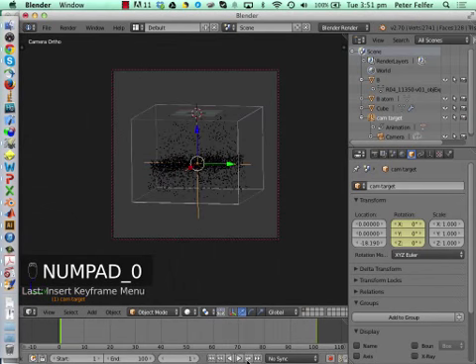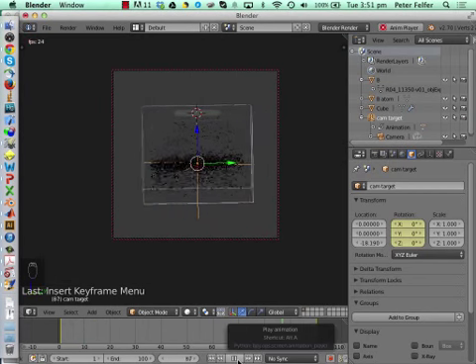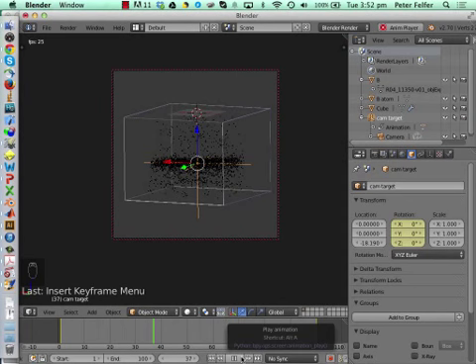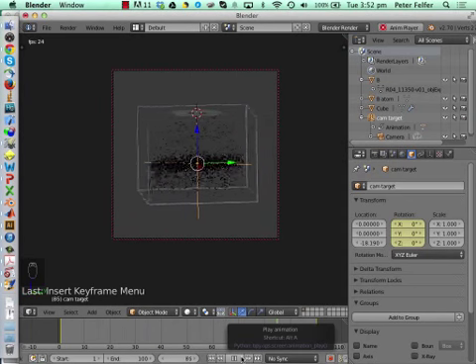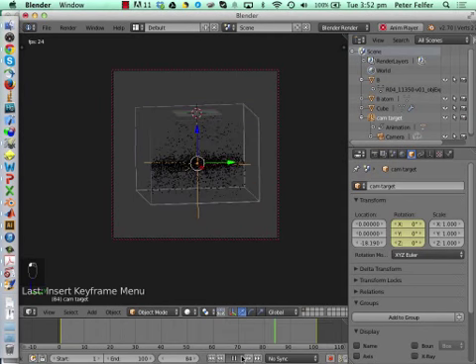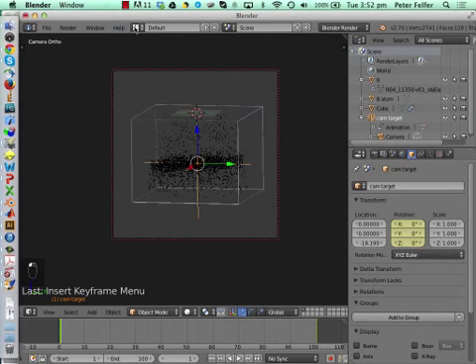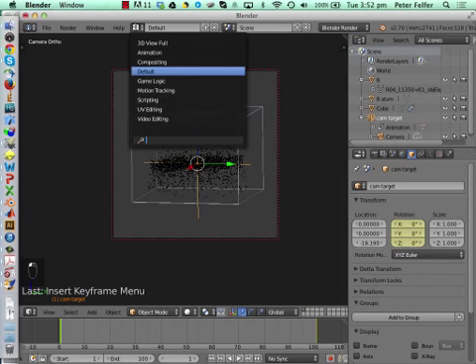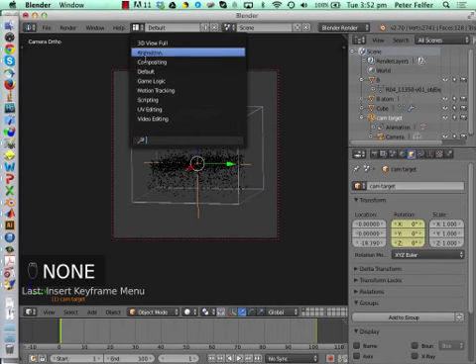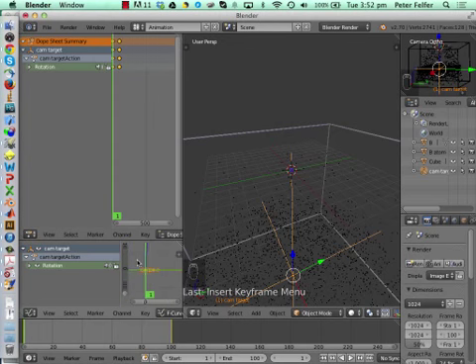But what you also notice is that it starts out and then speeds up and then slows down again. Which, of course, if you play that as a loop, which you would usually do, looks really weird. And the reason for that is the handles of the animation, and you can change that by going into animation layout here. So we were in the default layout. Now we're going into animation, and you've got the different F curves here.